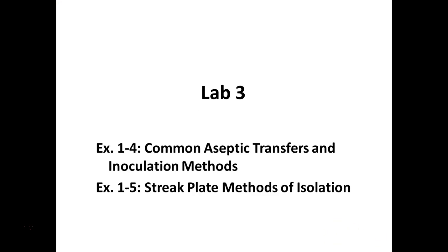So for today we're going to do two procedures. We're going to do aseptic transfers. We're actually going to do two of them. We're going to transfer from your stock unknown that I gave you to a broth and a slant that you just labeled. Then you're also going to do a streak plate, which is a method for isolating organisms.